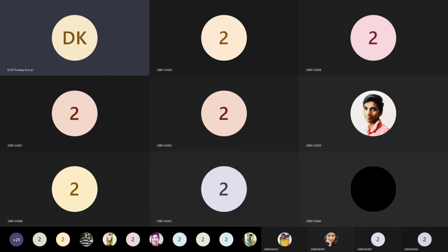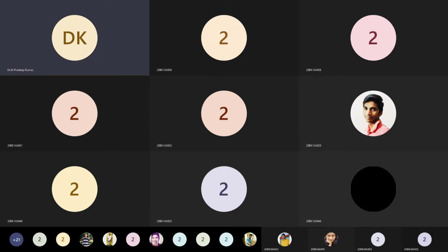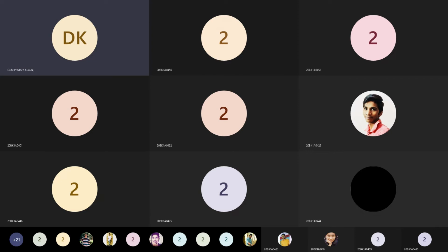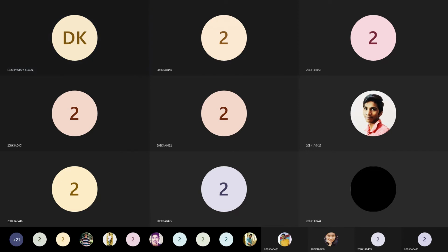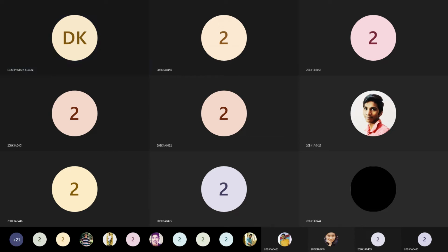2.608, sir. Okay. So actually we should get this much amount of aspirin since we have taken 2 gram of salicylic acid. So this is our theoretical yield. Remember, this is our theoretical yield. But actually how much do we have? Batni sir was not clear what the actual yield was.